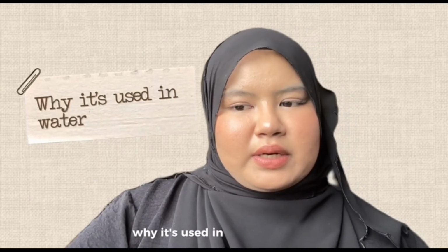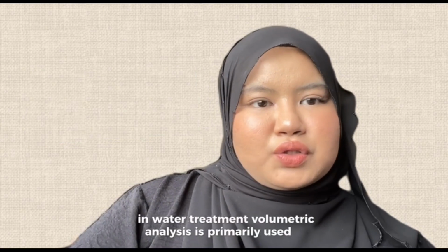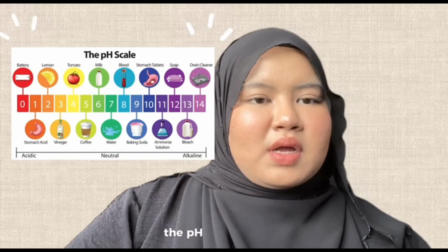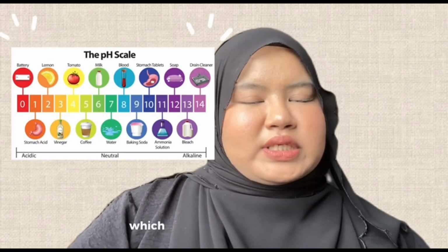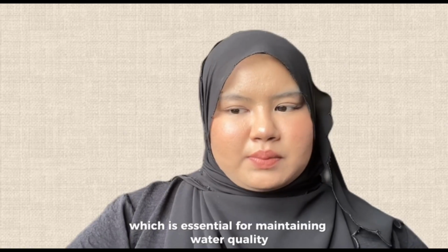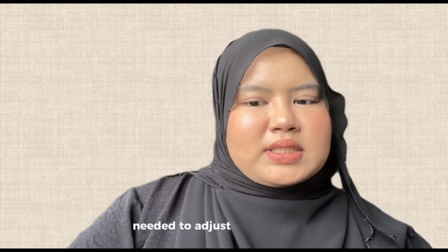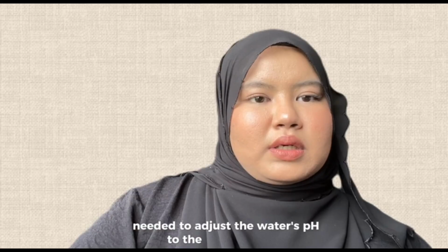Why is it used in water treatment? In water treatment, volumetric analysis is primarily used to measure the pH levels of water, which is essential for maintaining water quality. Titration helps determine the amount of acid or base needed to adjust the water's pH to the required level.